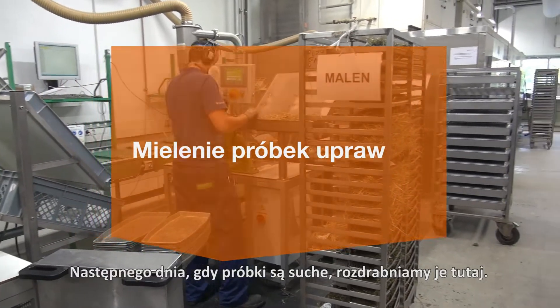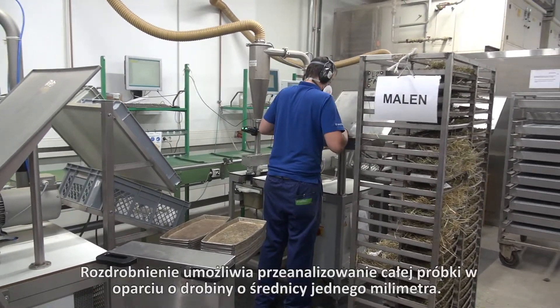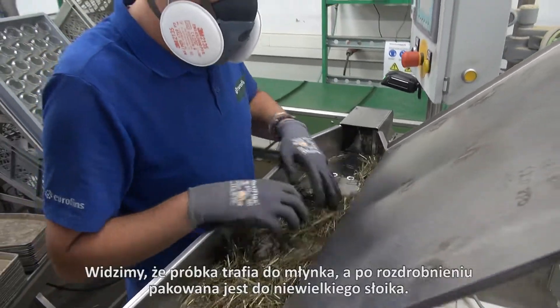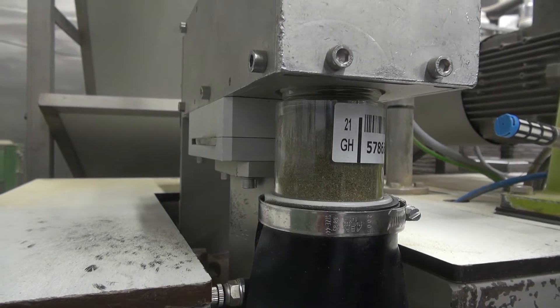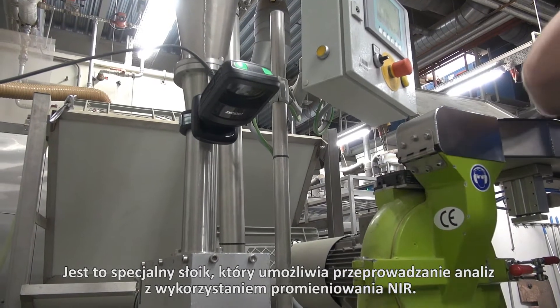So now it's the next day. The samples are dry and we grind them here. We grind them so that we can analyze the whole sample into one millimeter, as you can see here. He is pushing the sample in the grinder and it comes out in a little jar. That jar is a special jar so that we can analyze it by near infrared.